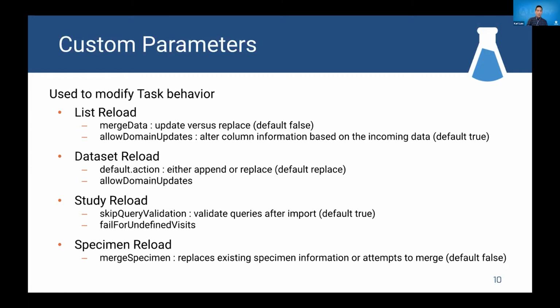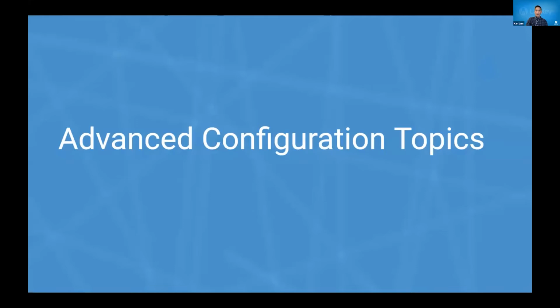For study reload, you can set query validation as well as fail for undefined visits. These are similar options to what you see in the UI when you manually do a study reload, so it just mimics those existing ones. And then for specimen reload, you have the option of merging or replace as well. Okay, so I'm going to move on to some more advanced configuration topics.